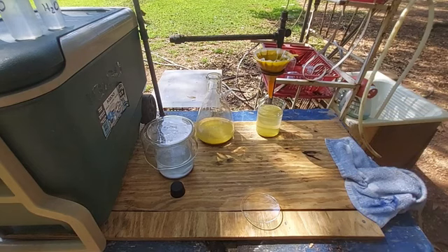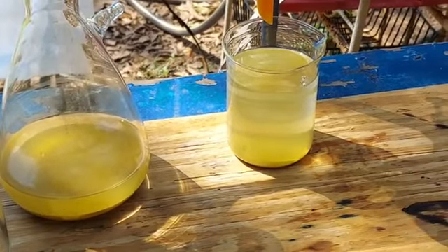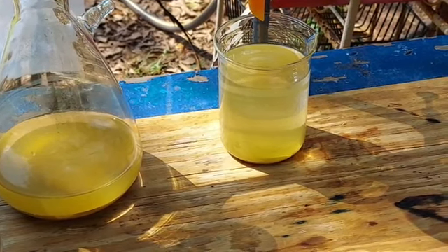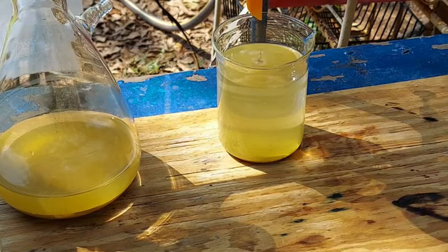Mercury in something with a pH this high, somewhere between 12 and 14, is going to be most stable as the oxide, so it will precipitate out. Now, yes, you can see there is a little bit of it suspended in the liquid there. However, the trick to deal with that is to let it sit overnight in the covered beaker, allow everything to settle out, decant off the clear liquid, and then refilter what's at the bottom.